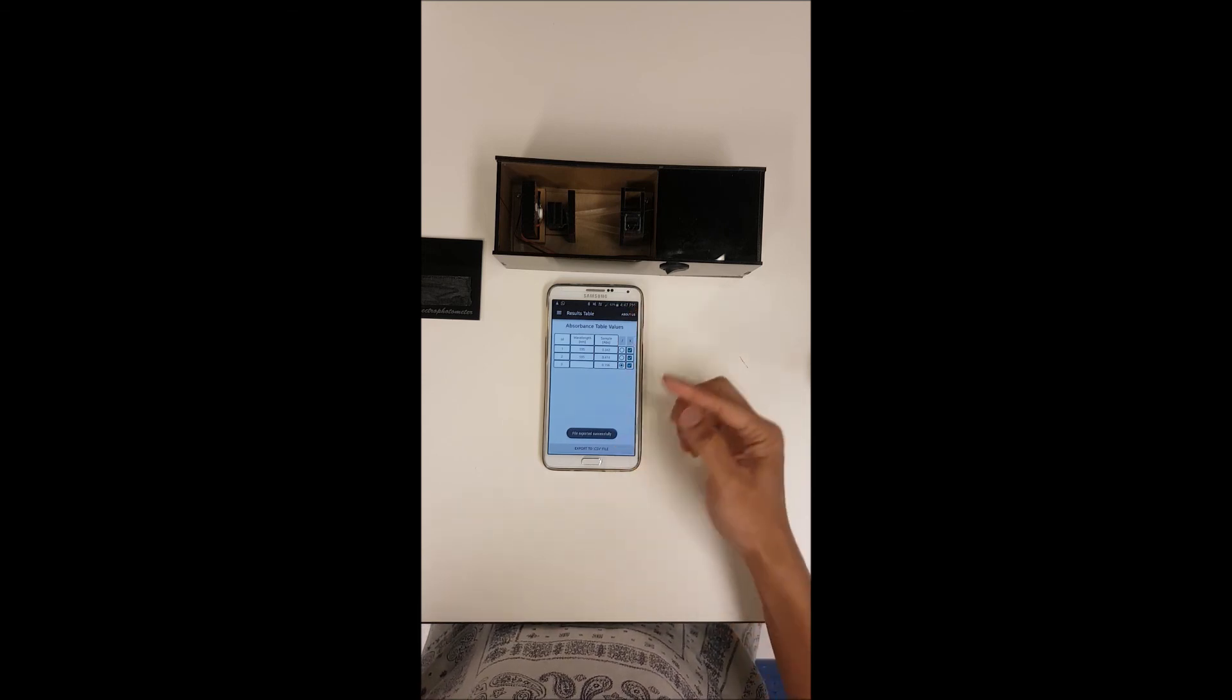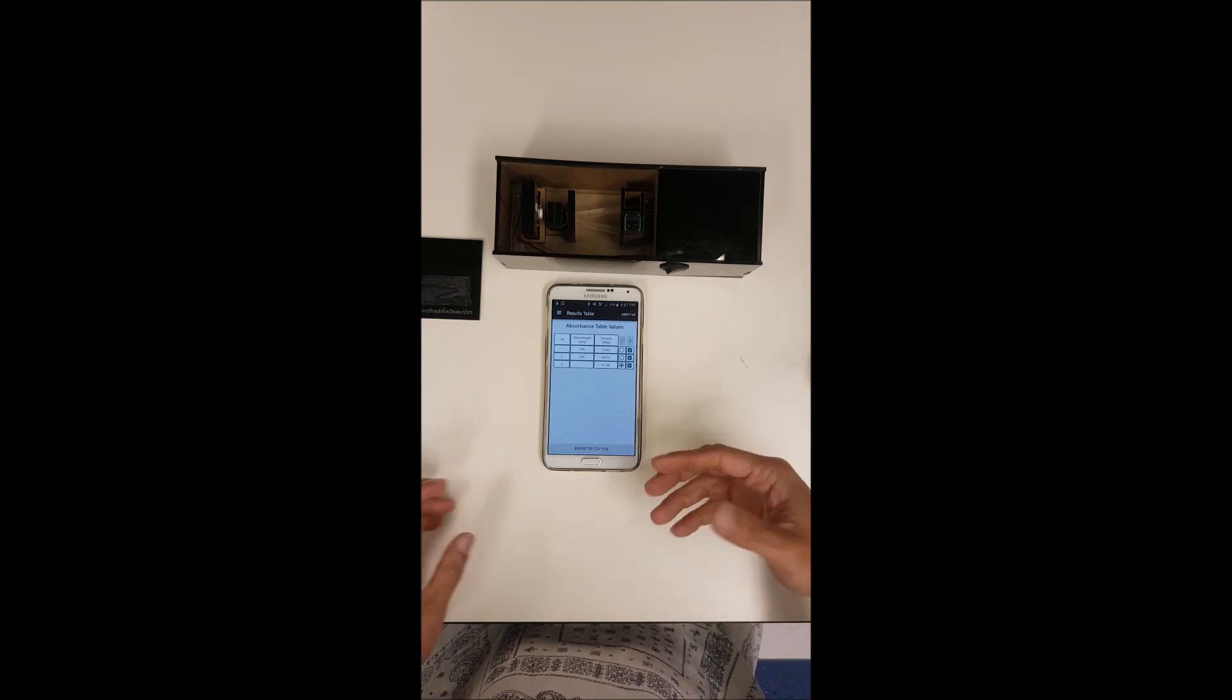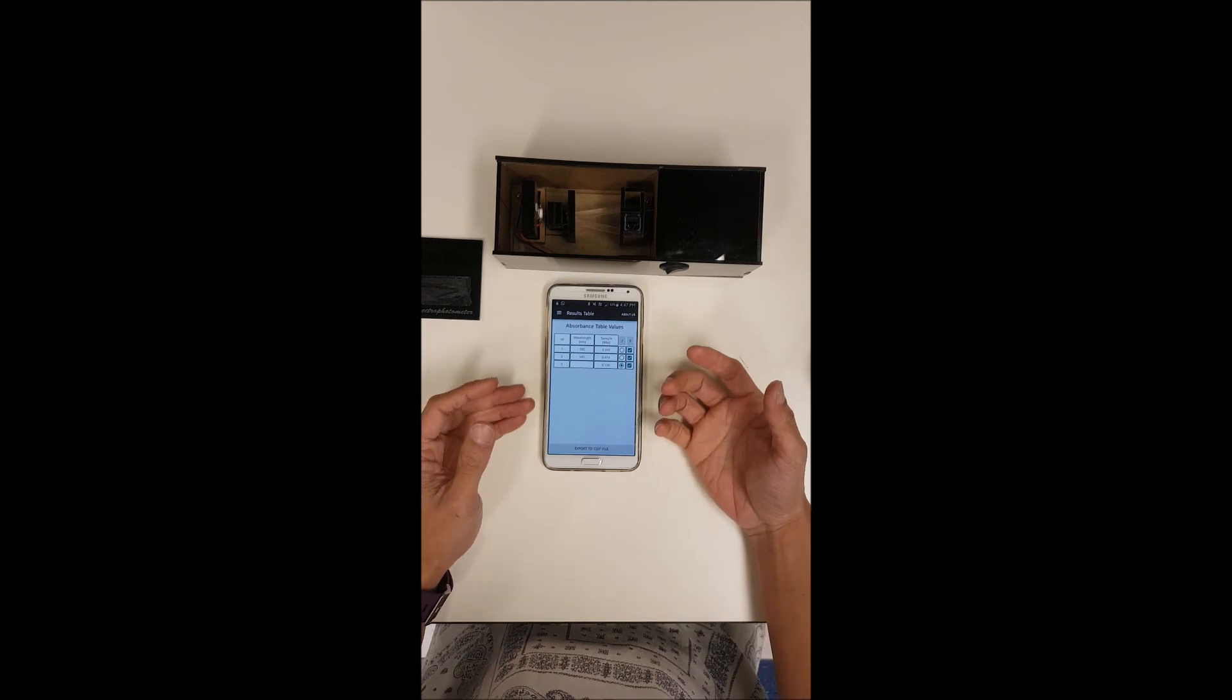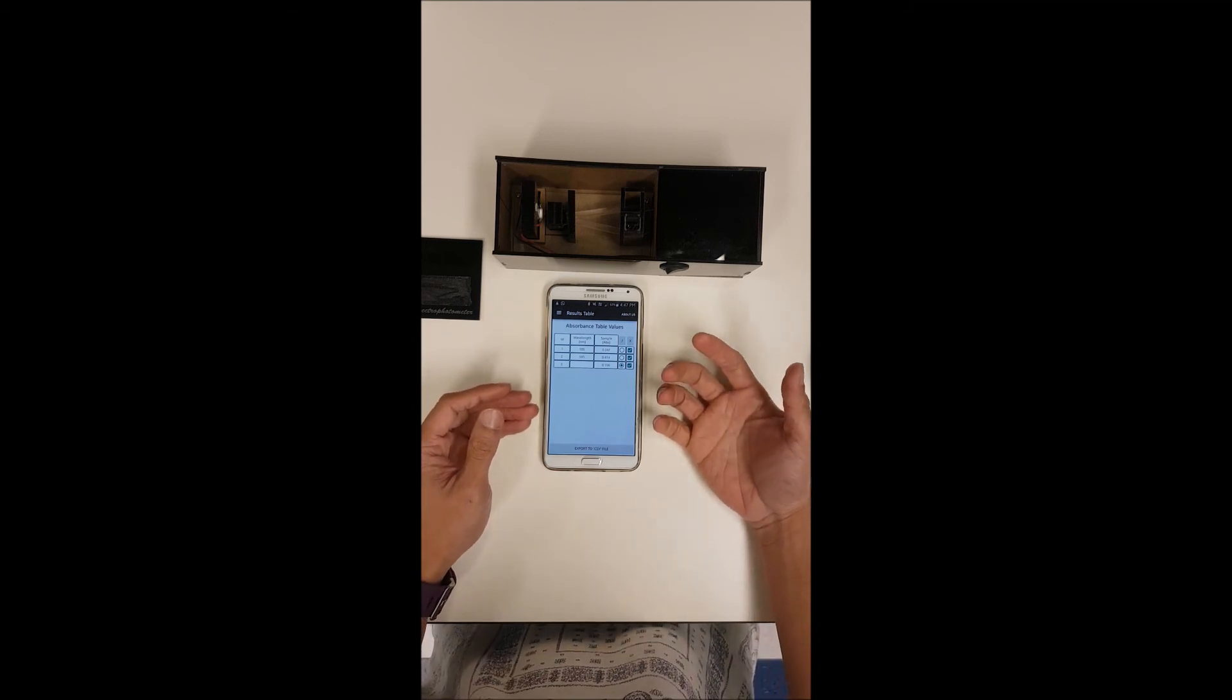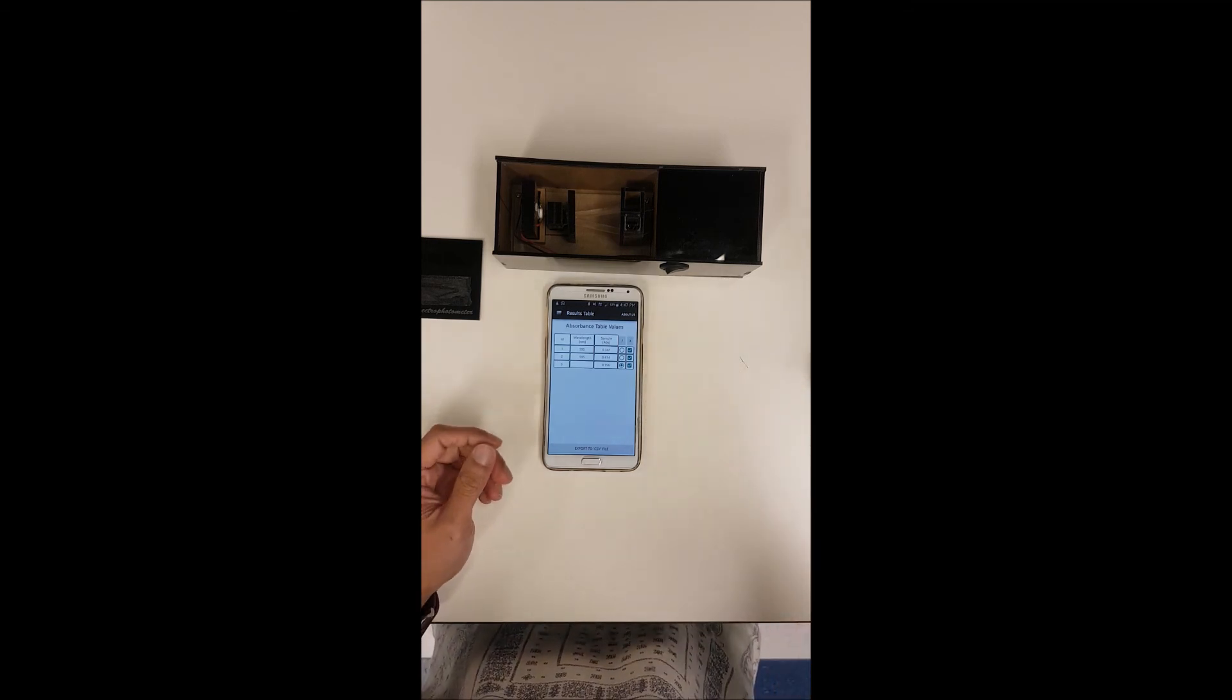Once the file has been exported you can then use your Windows or another software to open it.